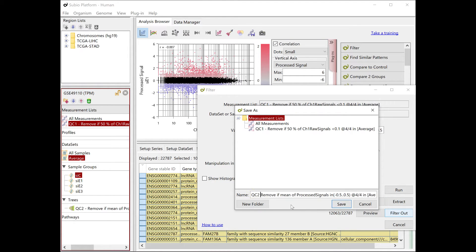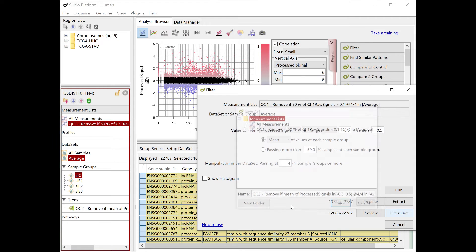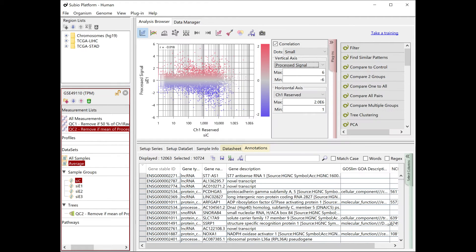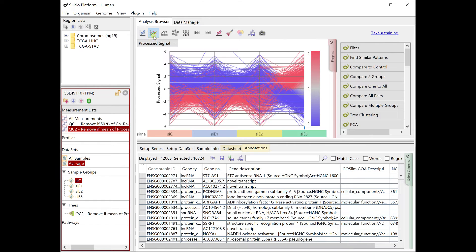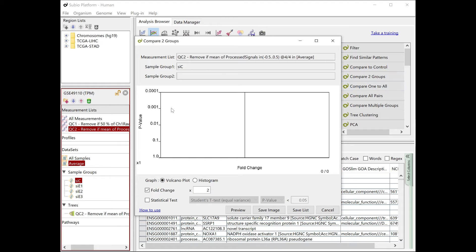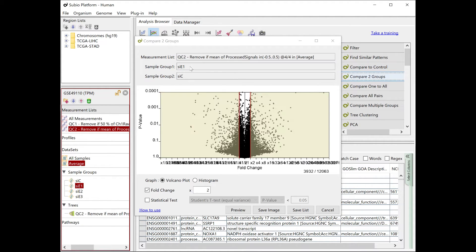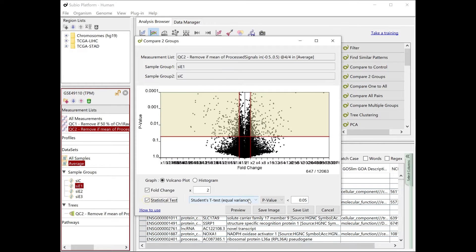Exclude these genes to make the QC2 list. From this QC2 list, we extract the genes whose expression is altered by CE1 treatment compared to CC. Use the Compare Two Groups tool. Adjust the criteria as viewing the volcano plot.